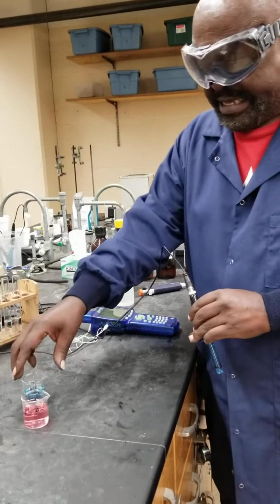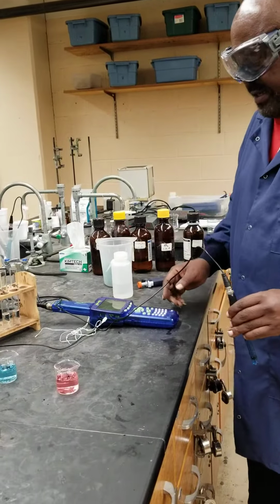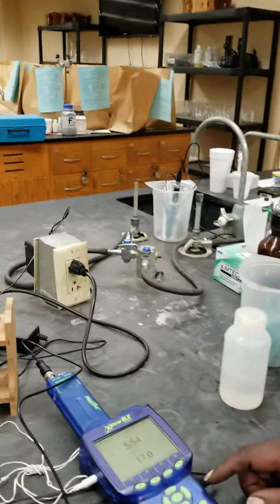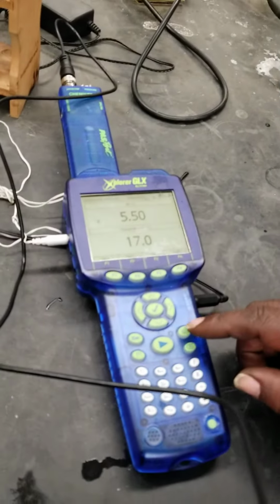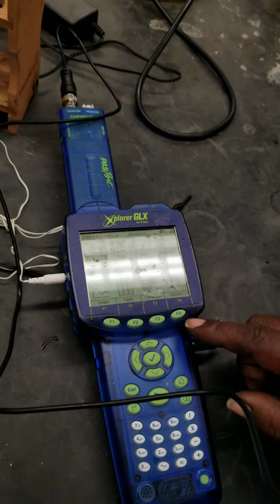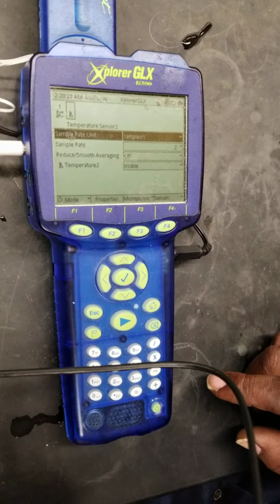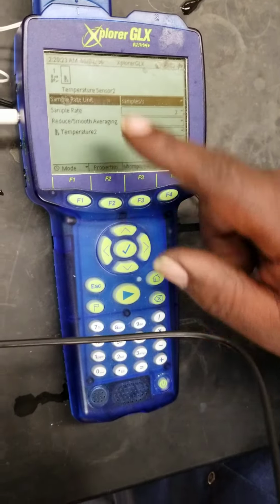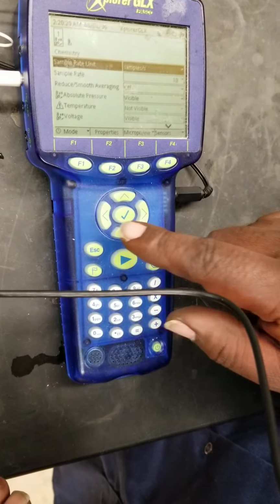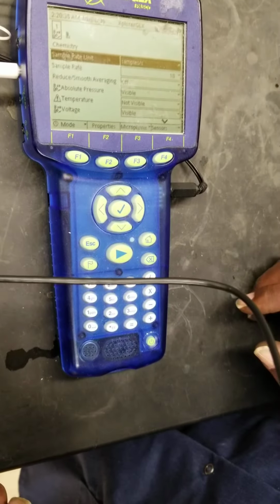So how does the calibration work? So you can get close here. Got something like this. In our directions, we would say press home, and then press sensors, F4. We press F4, and in this case, there's a temperature sensor and something else. So I'm going to say I want to calibrate the chemistry sensor and not the temperature part.